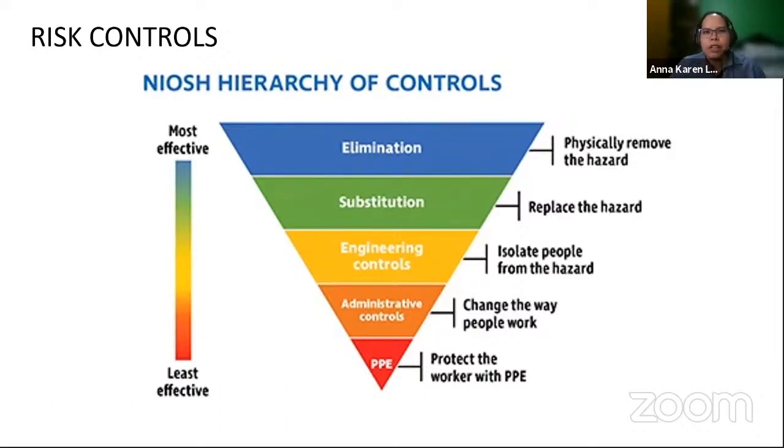So meron tayo na less, hindi masyadong hazardous, those that can be done on benchtop as long as you practice proper or good microbiological practices, then that is considered like BSL-1. Then of course you have those that are of relatively higher risk.